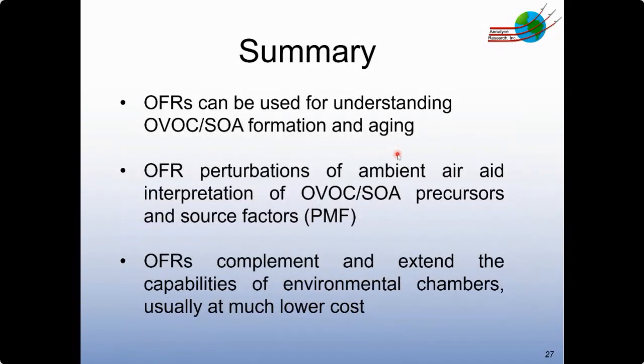So to summarize the main points from this talk, OFRs are being used routinely in the community now to look at and gain better understanding into OVOC and SOA formation and aging, both in the lab and in the field. It seems to be the case that perturbations of ambient air in situ with OFRs can, in some cases, aid significantly to the interpretation of precursors to OVOCs and SOA in the air that can then be followed up with targeted lab studies, as well as to aid in the interpretation of factor analysis of those ambient source factors using PMF and other types of principal component analyses.